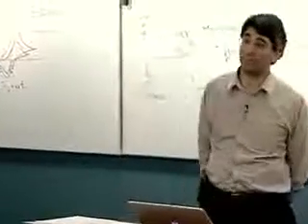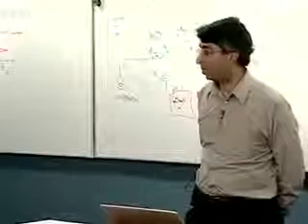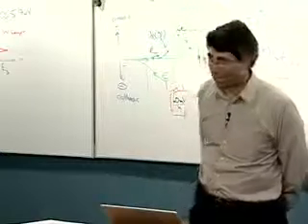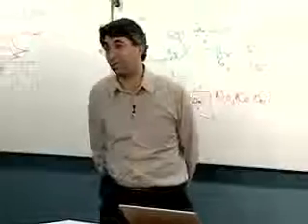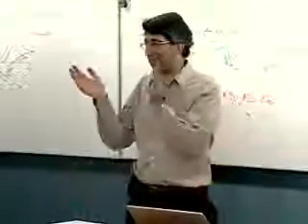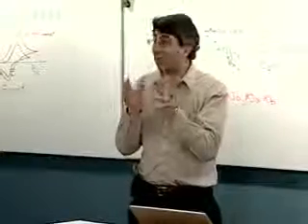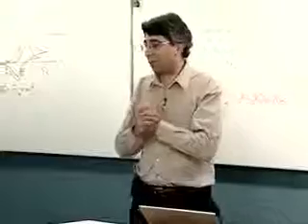The classic example is the hydroquinone-benzoquinone system, which in the presence of protons gives one wave that has 2 electrons in it for all intents and purposes. In the absence of protons, such as in acetonitrile, you get 2 perfectly separated 1-electron waves. But there's 2 electrons and 2 protons, and things happen so fast on the cyclic voltammetric timescale that you have to say it's a 2-electron process.